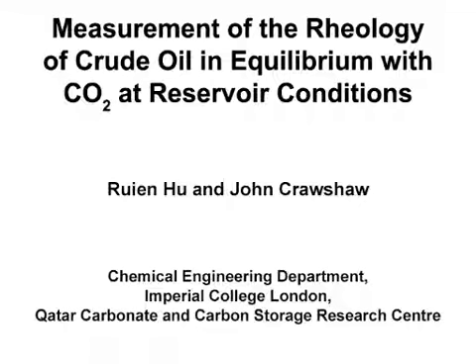The overall goal of this experiment is to study the effect of carbon dioxide dissolution on the rheology of crude oils. When CO2 is injected into an oil reservoir, it dissolves into the crude oil. This can strongly affect the oil rheology, a crucial parameter in predicting flow in the reservoir. The main advantage of this technique is the thorough measurement of the rheology of a gas-liquid mixture at reservoir conditions, answering the fundamental question whether the mixture is Newtonian or non-Newtonian.